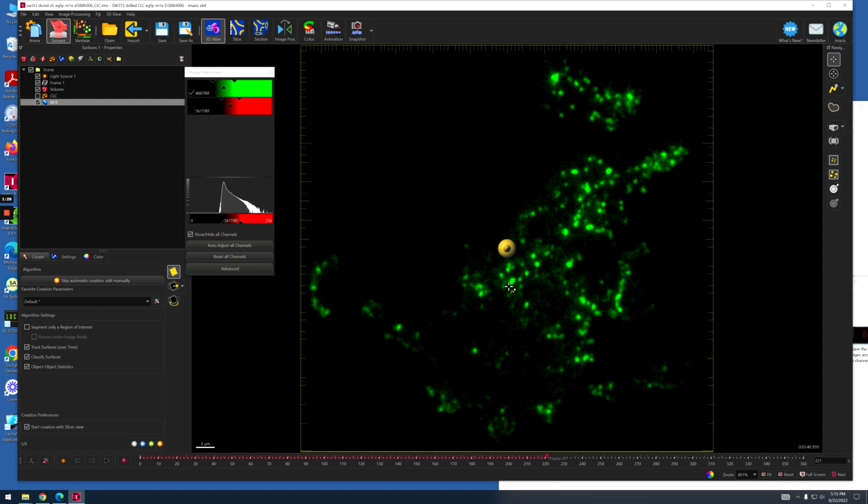In the case of M1E, the Imaris specialist Matthew suggested that the surface module would be better than using spot. And indeed, previously I used the spot module for M1E, and we just detect everything, and the background is super noisy. It's hard to separate the noise from the true signal.